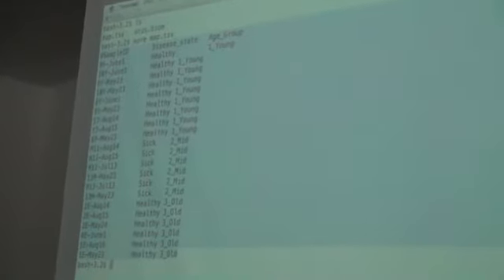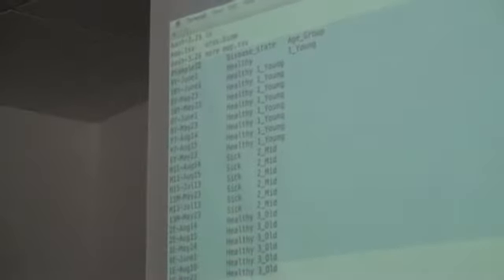So in this map file, this is just an example case. We have different samples, and we have these as our sample IDs, so these can be anything. These have to match what's actually in the OTU table for sample IDs. And then after that, we have different groupings. You can imagine you could have a disease state where we have healthy or sick that divides the samples up. Or in this case, these were actually taken from mice that have been aged. And so we have age groups for these different mice as well. So we have young, middle, and old. But you can have lots of different groupings as well.